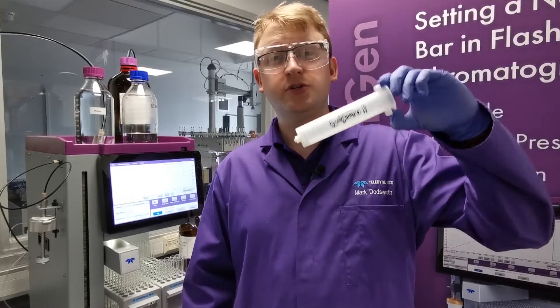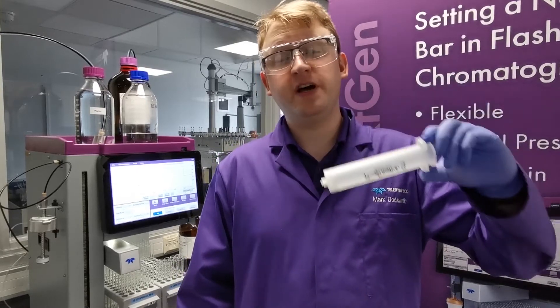Hi, I'm Mark from Teledainisco, and welcome back to our how-to series. What happens when your liquid sample doesn't dissolve in the solvent that you want to load in? On the Teledainisco system we have the capability to use solid loading as an alternative method of loading your sample. In this short video I'm going to show you just how easy it is to use our solid load cartridges in order to purify those tricky samples that you're unable to dissolve.